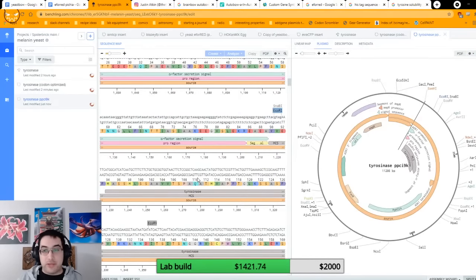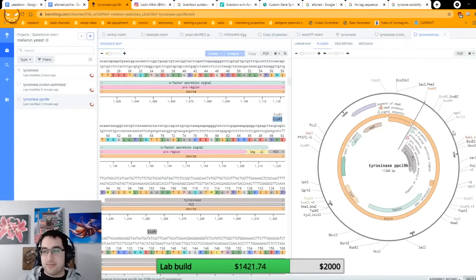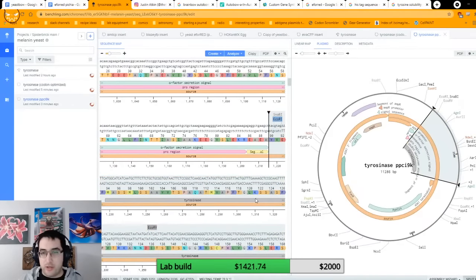But yeah, that's basically it. Done. Easy as that. I like it when plasmids are nice and easy like this. You just do the thing, a little paste, and it just works. It's great. I love that. As opposed to this nonsense that took me literally a whole day to get to work. But this, it's nice, it's clean, clear, under control. Okay, let's delete that annotation. It is no longer helpful.